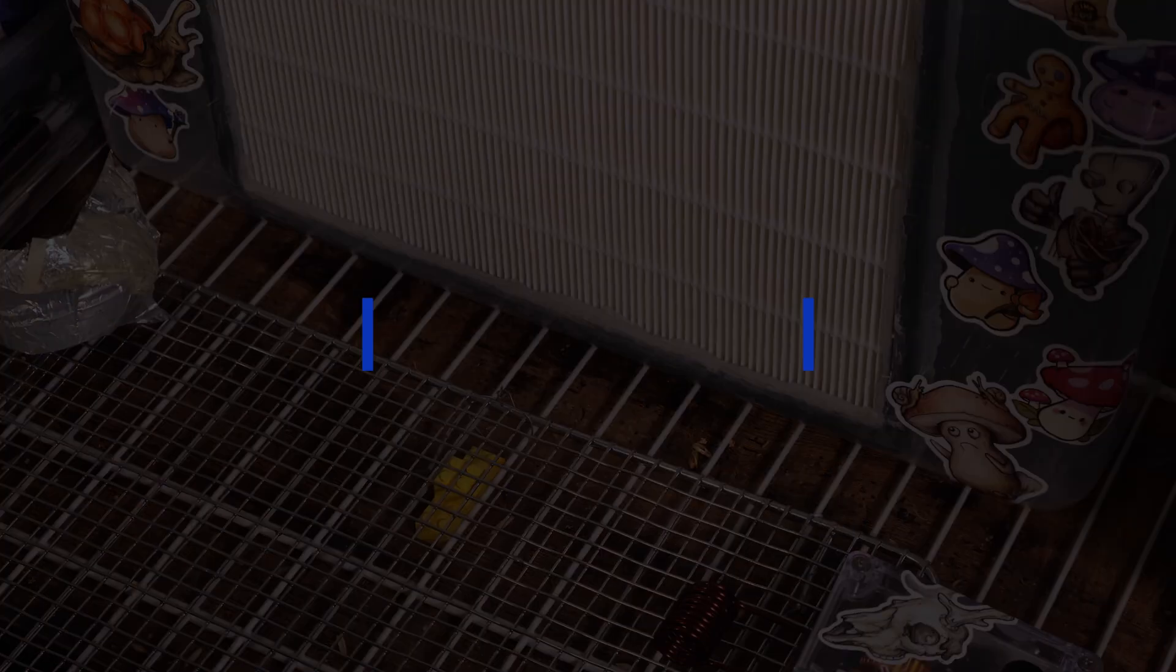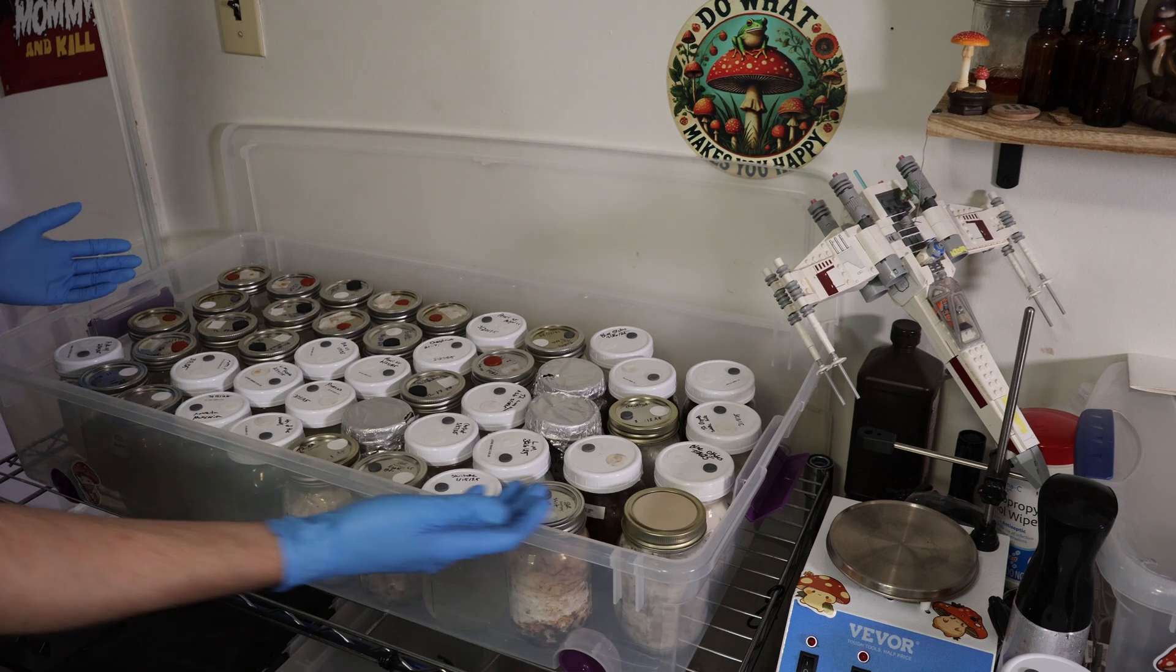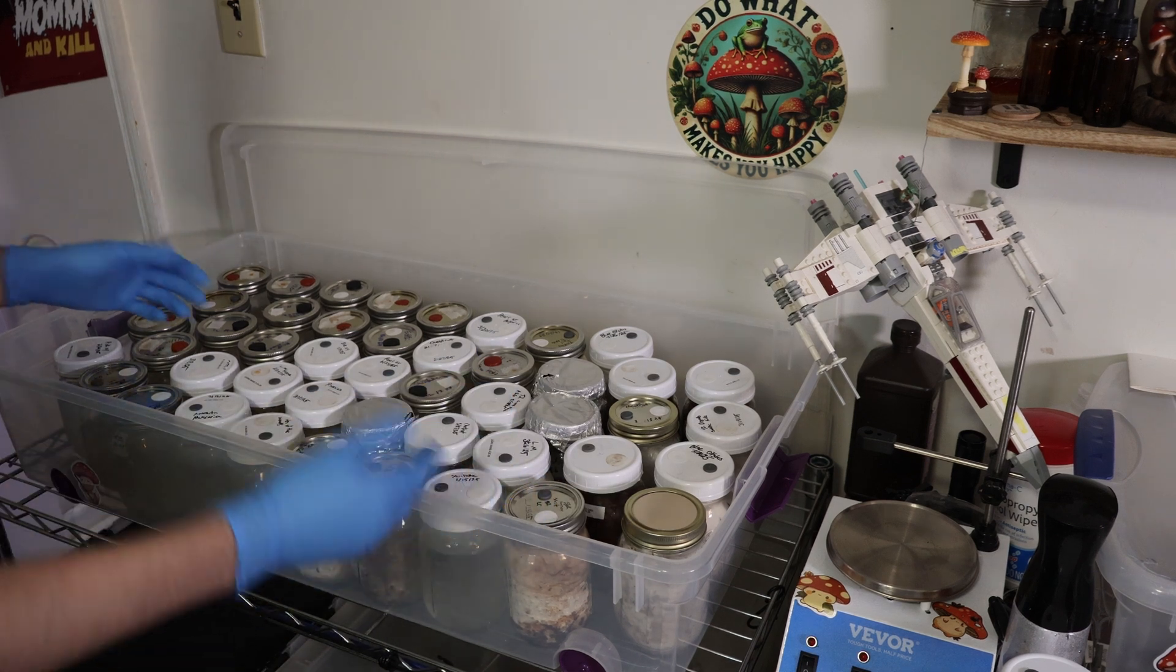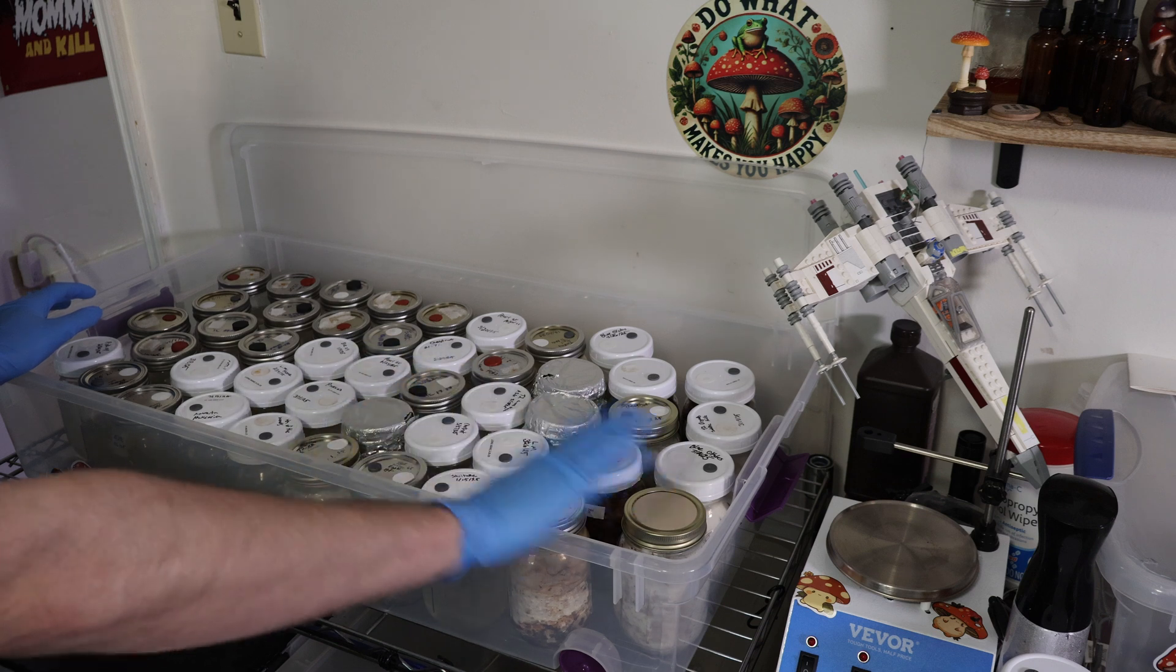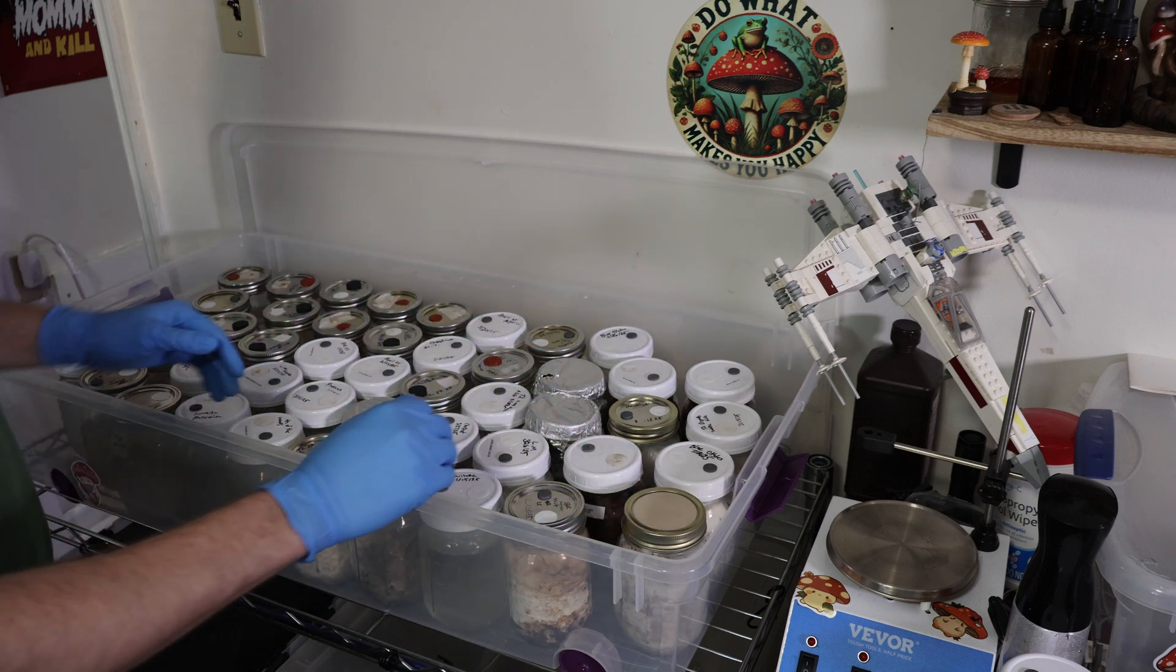Let's take a peek at the incubation area as well. I don't think I've shown that off in a while. Over here in the incubation area there's not too much going on but we have all of our labels on everything. Our liquid culture is pretty much all over here. Grain and our plugs and everything is going to be over here.